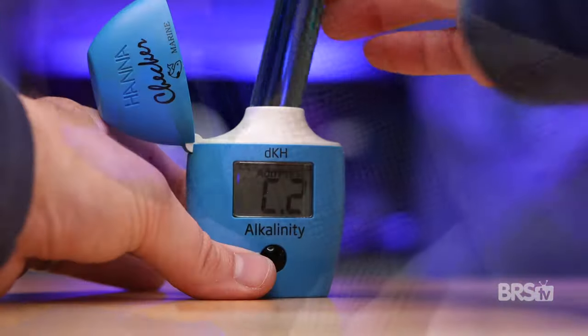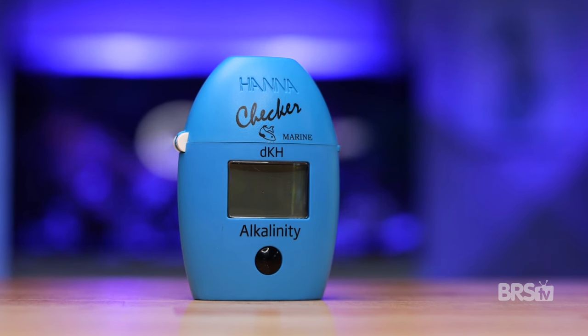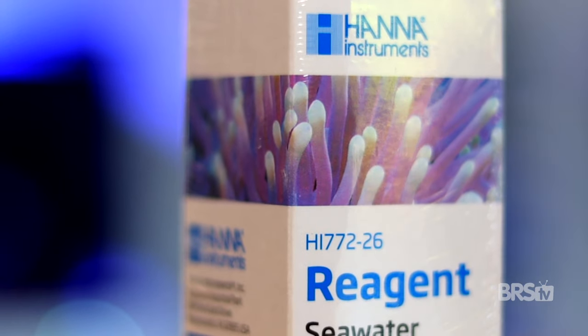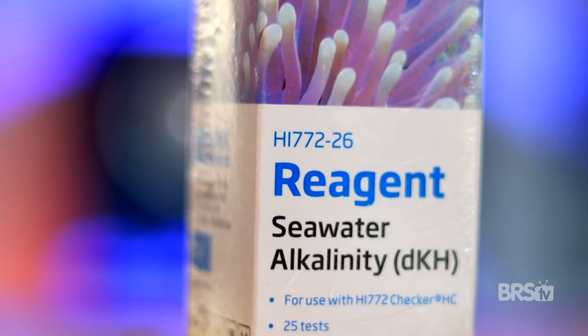Wipe any fingerprints off the cuvette and then slide it back into the checker. Press the button and wait for the results. Be sure to rinse and dry the cuvette, the cap, and the plastic tip after each use before storing. I always like to have an extra bottle of reagent on hand, as well as a couple of cuvettes for when I inevitably drop one.